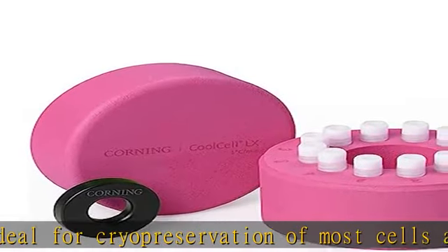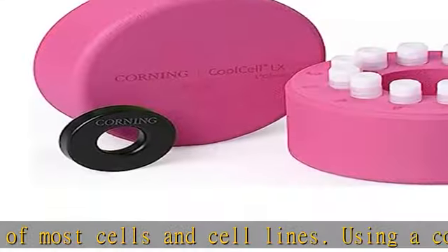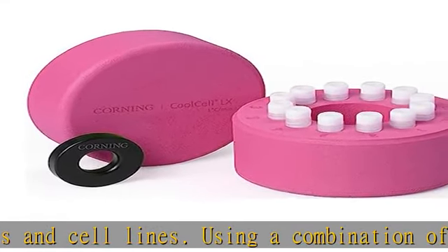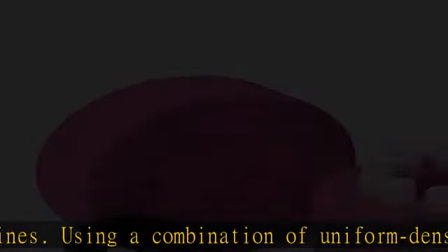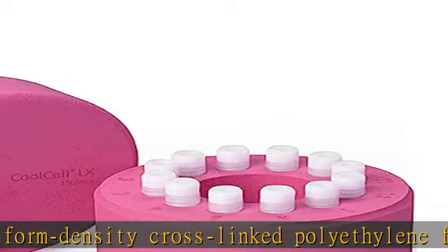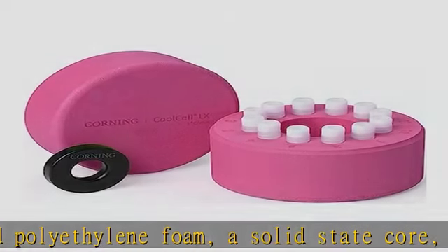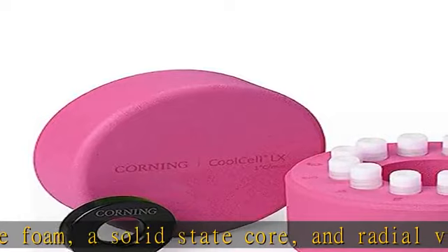The foam is non-absorbent and will impose negligible change in the freezer environment, thereby protecting nearby frozen samples. The low heat content also ensures that Cool Cell LX containers will rapidly return to room temperature when removed from the freezer. Check the description to get this product today at the best price.